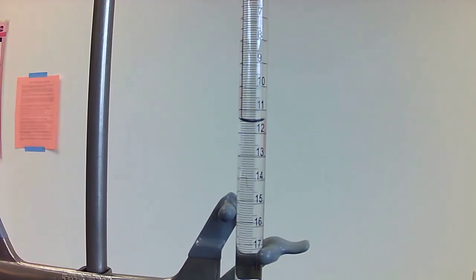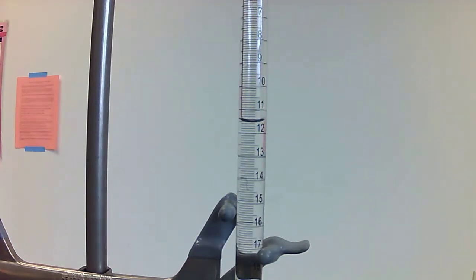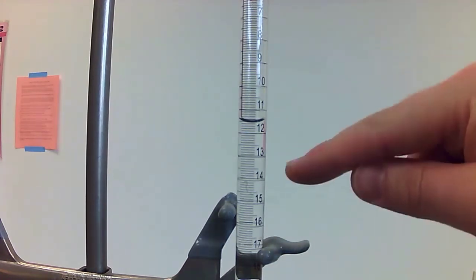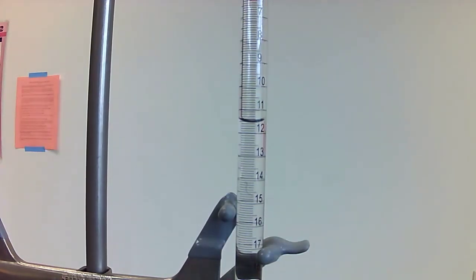The other thing to keep in mind is that you measure from the bottom of the meniscus. Because the water is polar and the glass is polar, the water climbs up the edges of the glass and makes this dent in the middle. And all of our glassware is calibrated to read from the bottom of the meniscus. So basically you just take the lowest point where you see it here.